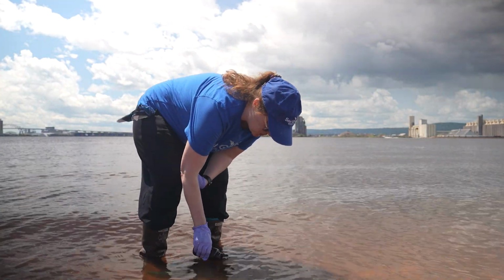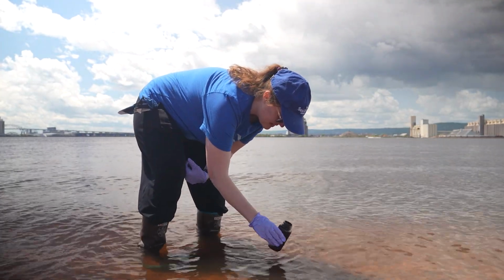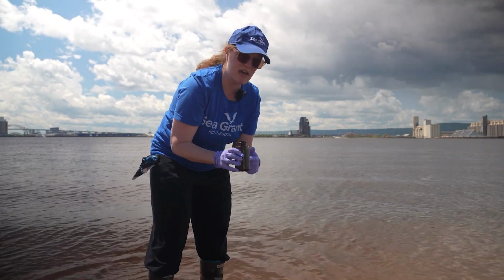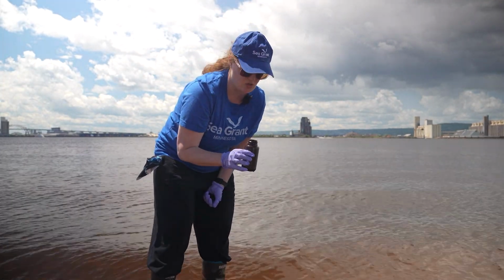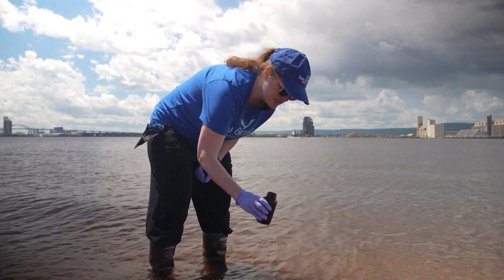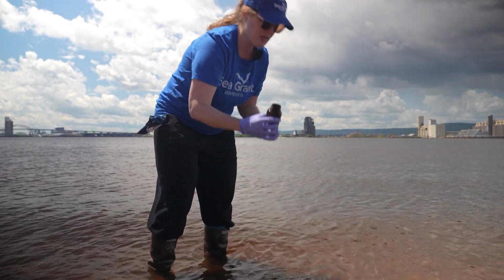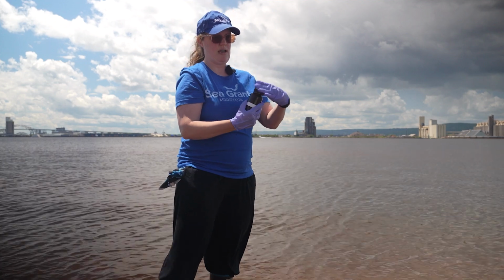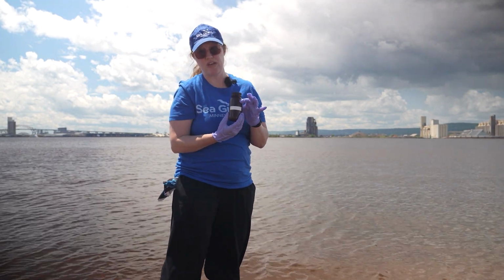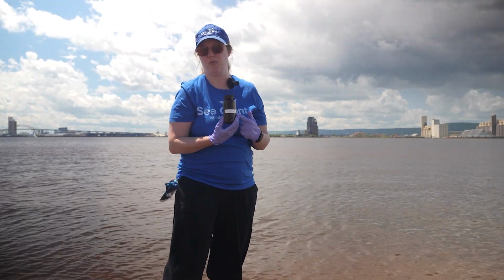So we're just going to do a quick skim right at the surface, fill that about halfway. Your sample bottles will have a mark at the halfway point, so you'll know about how much. If you get too much in there, you can just dump that extra out at the top. Put your cap on, and then the next step will be to use your marker, also provided in your kit, to label your sample bottle.